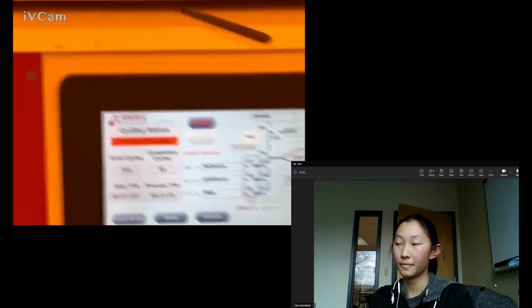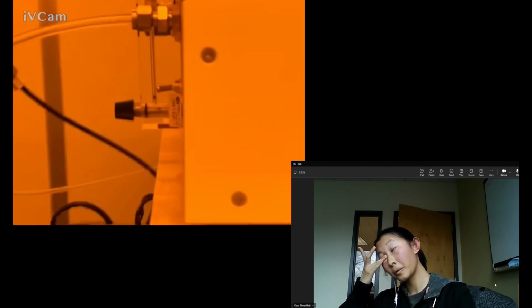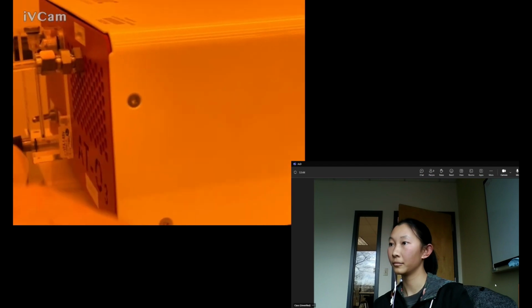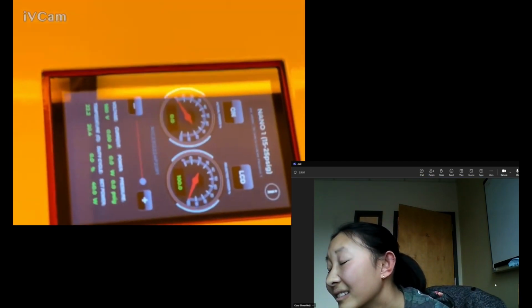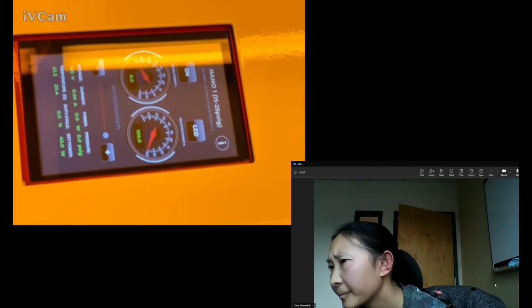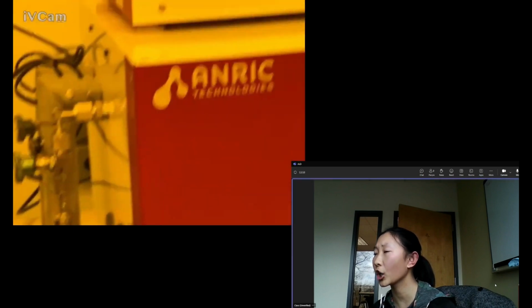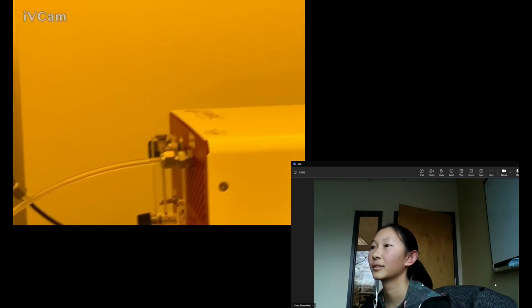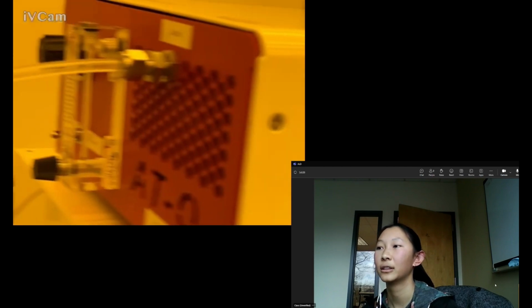I don't know what that was. It is dropping. Air being released, yeah, through the valve. There was a big popping noise, and the ball in there shot up and now it went back down. I guess let's see. Anything? No, still no pressure. Do you hear any air, like leaks or hissing? Well, we did all of a sudden. There was a really loud popping sound, but now I'm not sure if there's air being released or not.